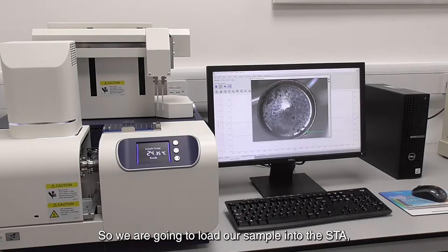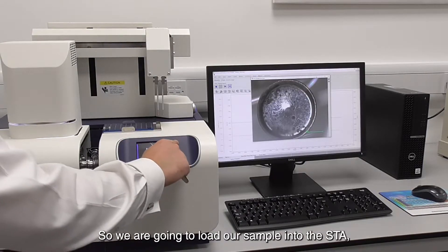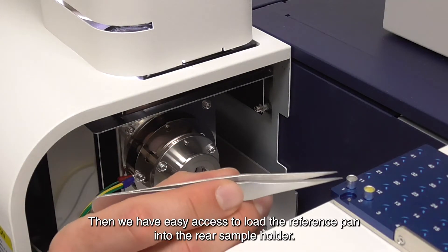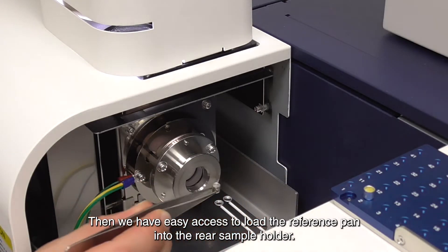So we're going to load our sample into the STA. We need to open the furnace, then we have easy access to load the reference pan into the rear sample holder.